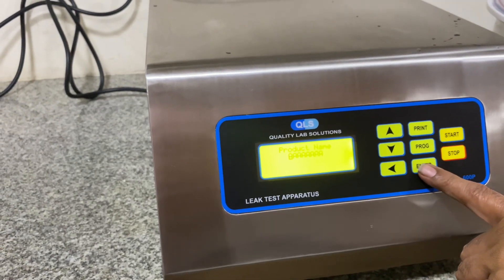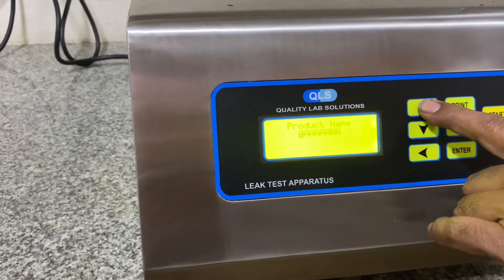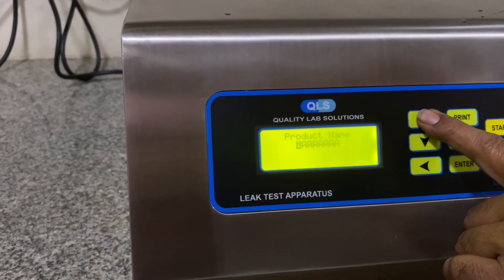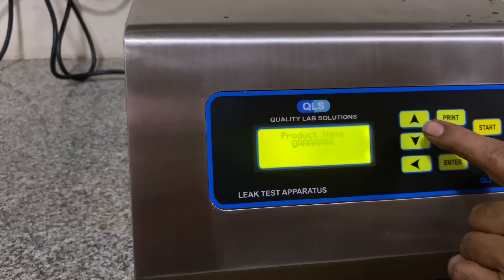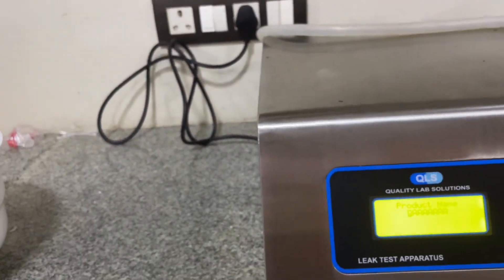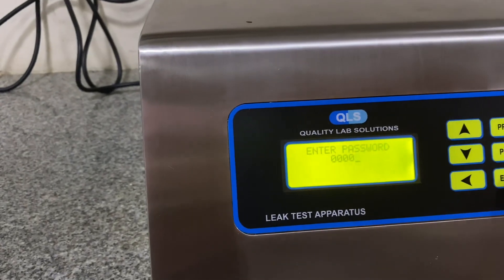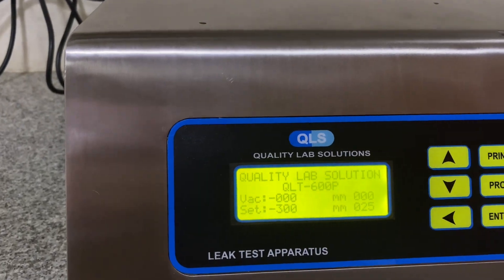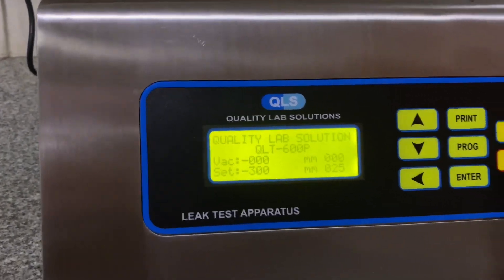We proceed with batch number entry and product name entry. Now the home screen is ready with the programming part — we have set the vacuum to minus 300 mbar.